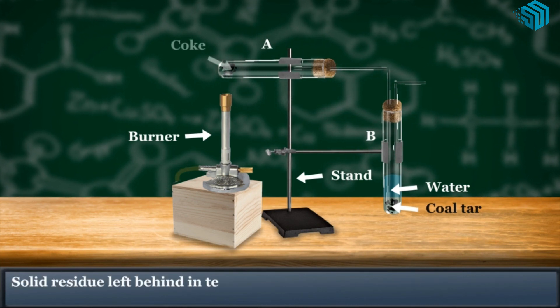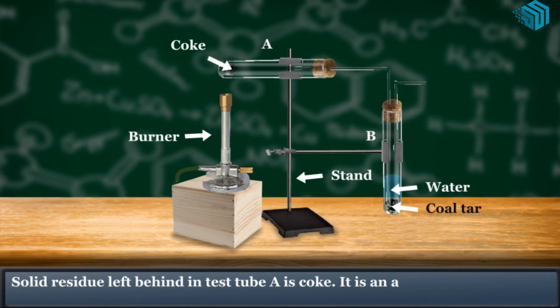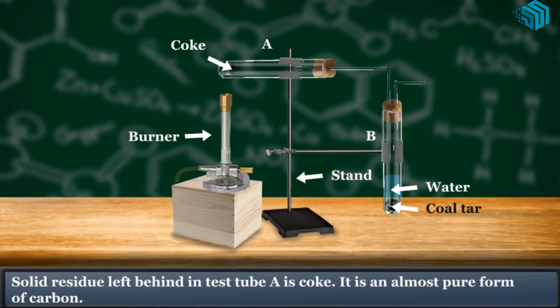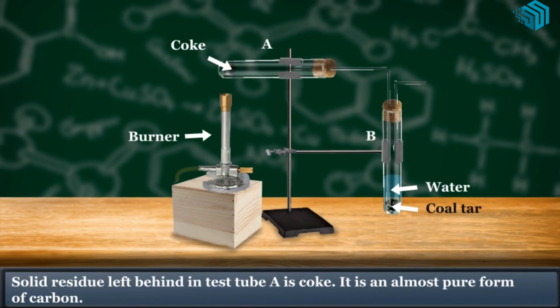Solid residue left behind in the test tube A is coke. It is an almost pure form of carbon.